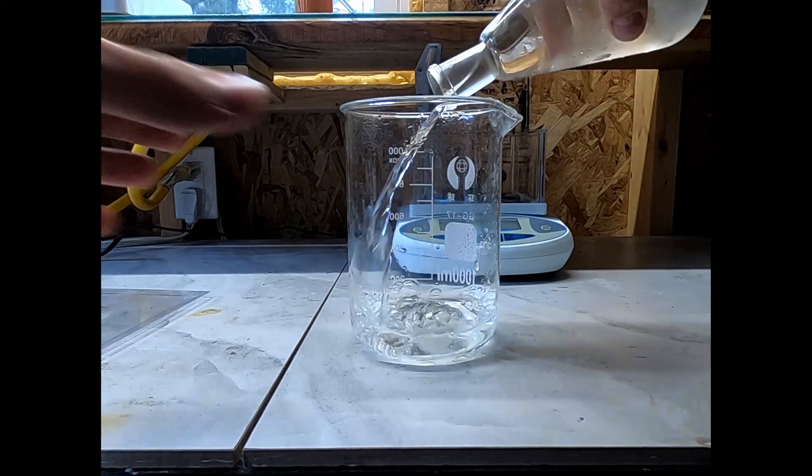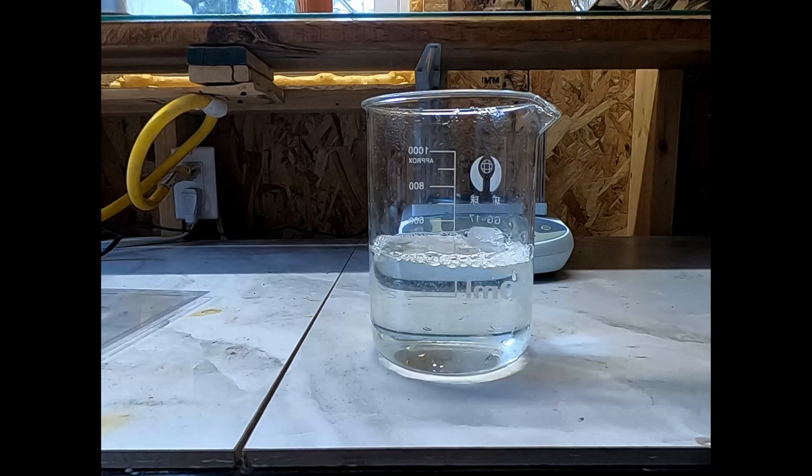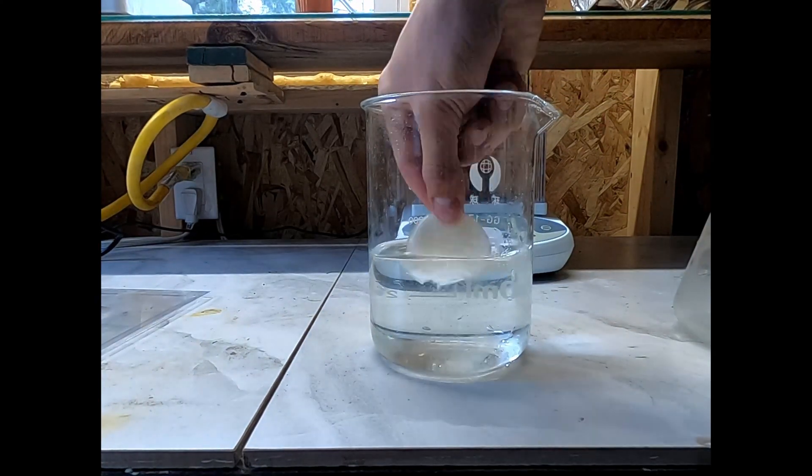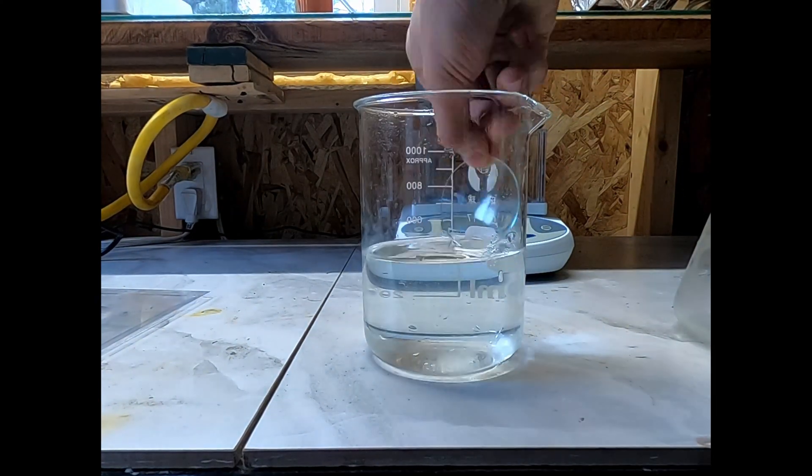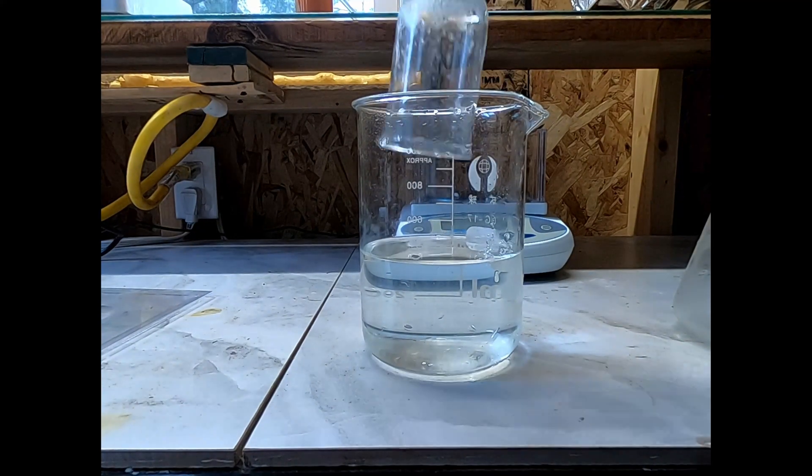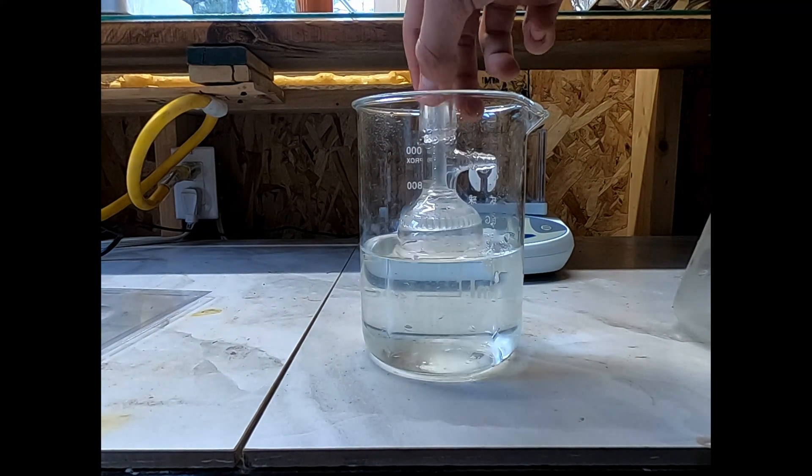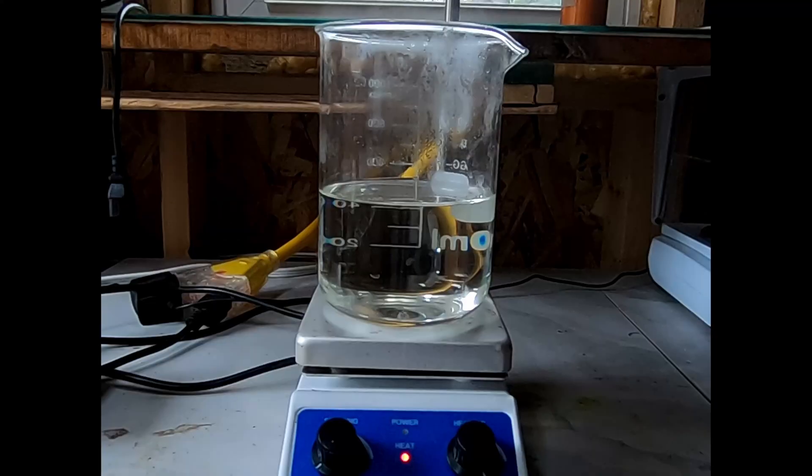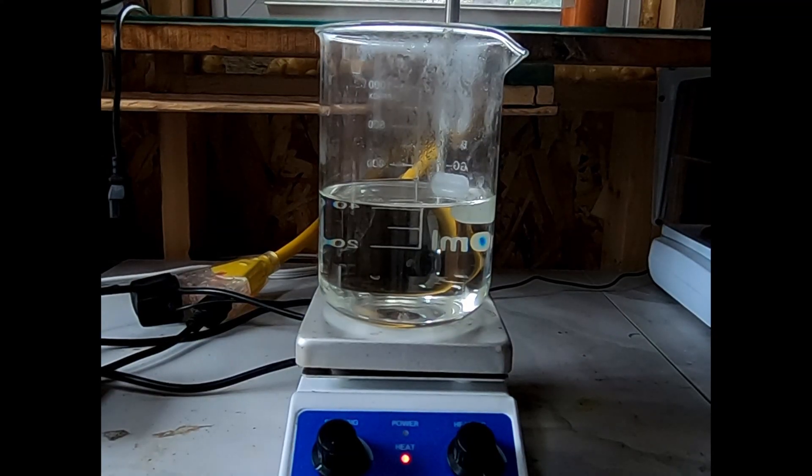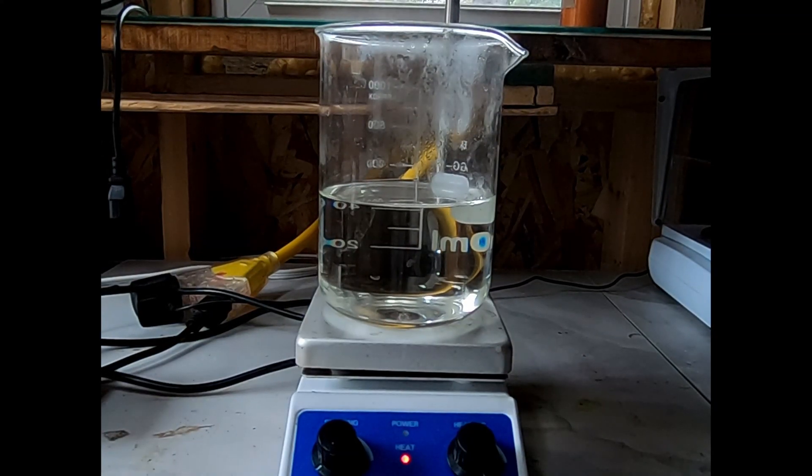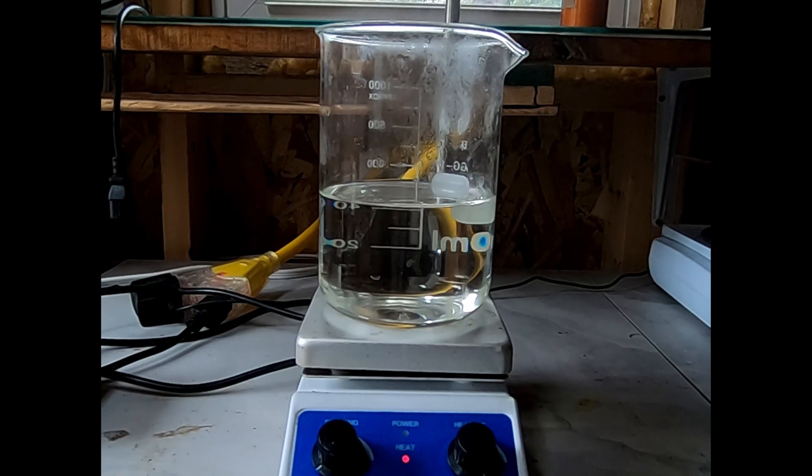I start by pouring all of the filtrate from the vacuum filtration into my large beaker. I then proceed to wash all the different filters and pieces of apparatus that I used to try and dissolve as much of the crystals as possible to improve my yield. Once I'm done preparing my solution, I place it on the hot plate and heat it up to evaporate off as much water as possible to reduce the solubility of sodium carbonate.